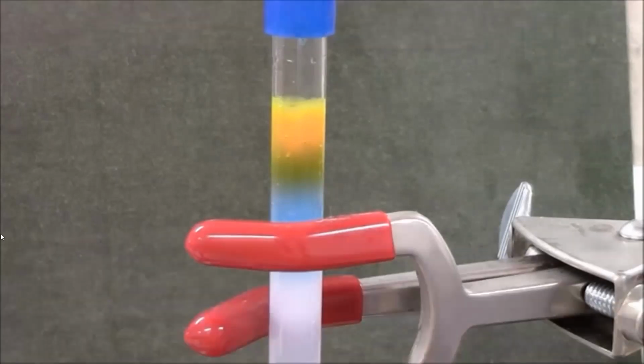I'm going to try to have a decently large volume this time of buffer on the top. About a milliliter would be great. If I do this well, then the buffer that I put on the top remains colorless because all the colored molecules have already gone into the gel.